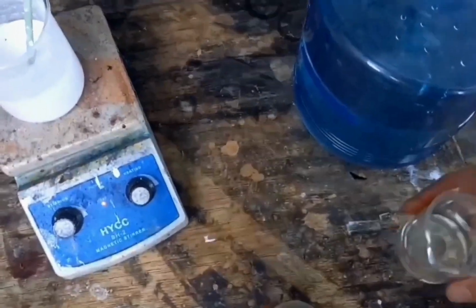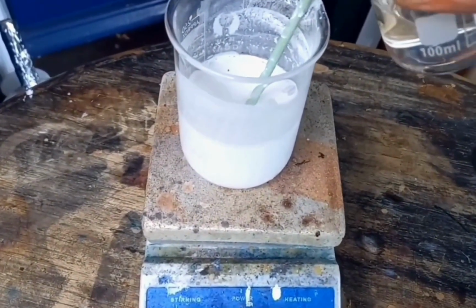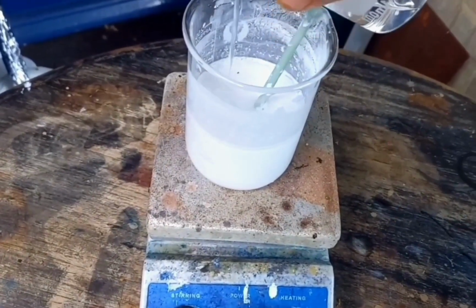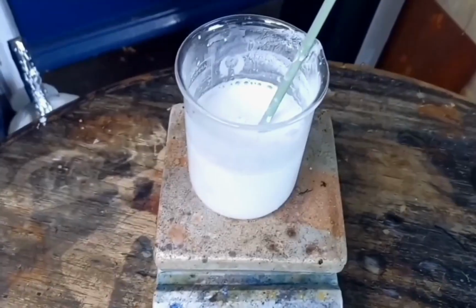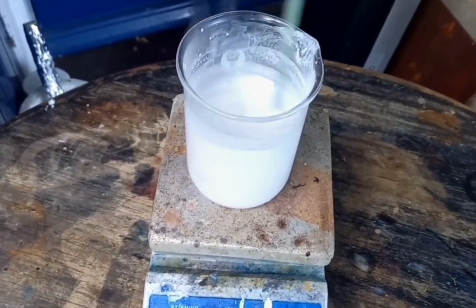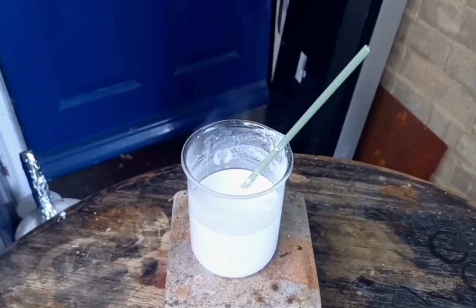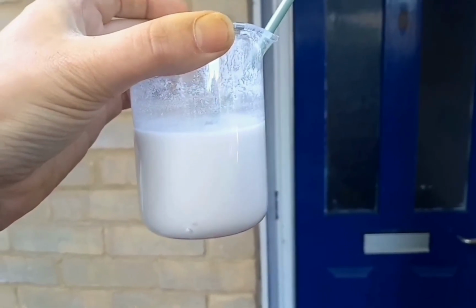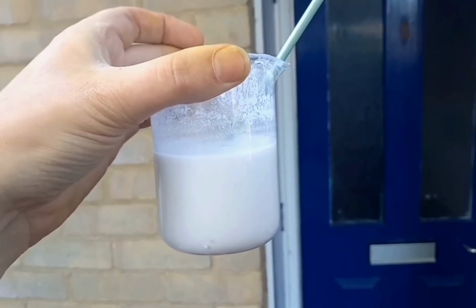Now we'll add this to our barium selenate. Something going on. And since I don't have a centrifuge, I'm going to have to leave this standing for probably like a day.